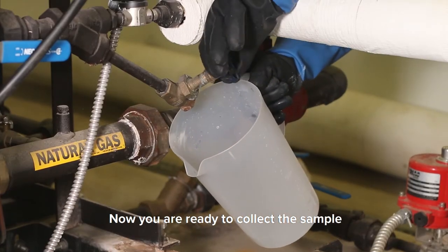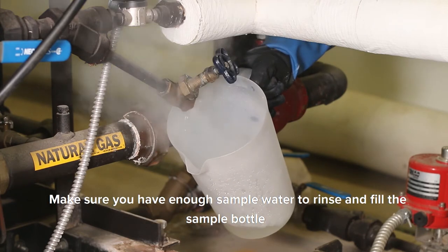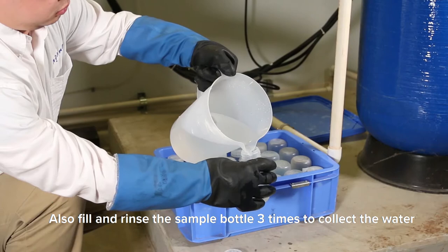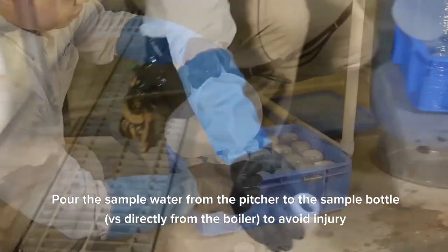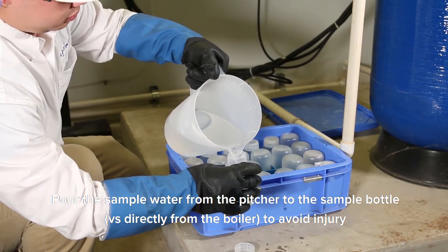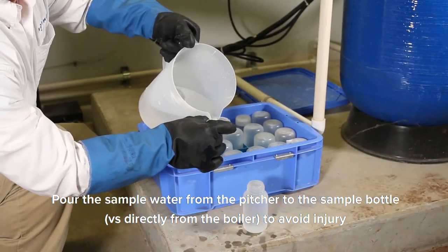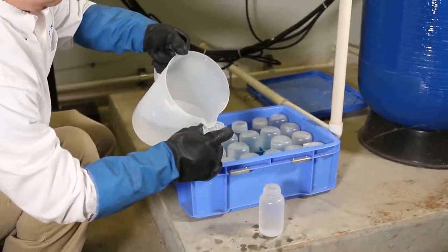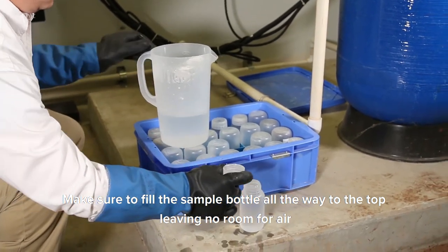Now you're ready to collect the sample. Make sure you have enough sample water to rinse and fill the sample bottles. Also fill and rinse the sample bottle 3 times to collect the water. Pour the sample water from the pitcher to the sample bottle versus directly from the boiler water to avoid injury.